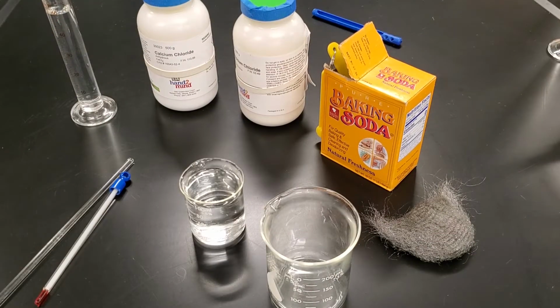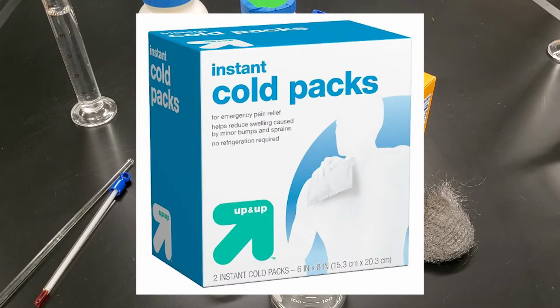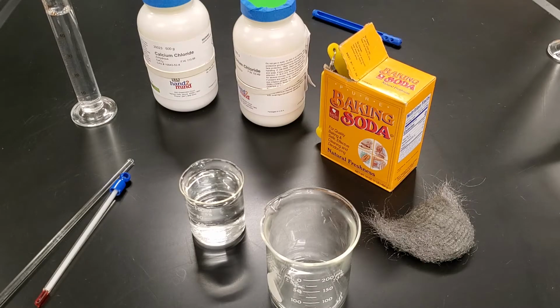So this is the chemical process lab. We're going to test different chemical processes to determine what might be used for a cold pack. We're going to calculate temperature changes that occur and make observations about how each chemical process might behave.